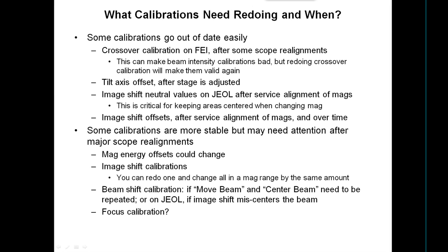The tilt axis offset, if you enter it in the property file, goes out of date every time the stage gets touched by service — or probably does. If service is good, they'll adjust it to within one micron and it won't matter. But the fact is they often don't, and unless you insist on them adjusting it when it drifts, you'll end up with a random different value at various times.